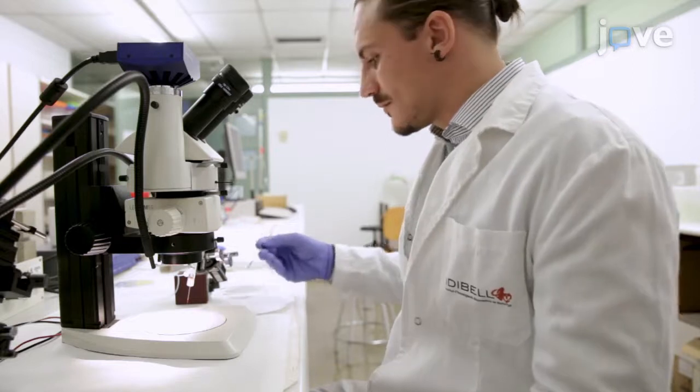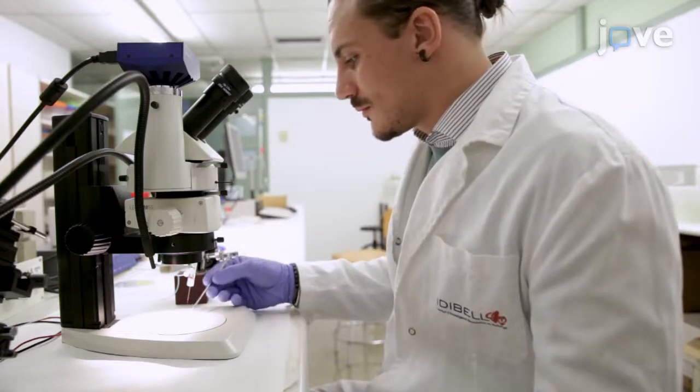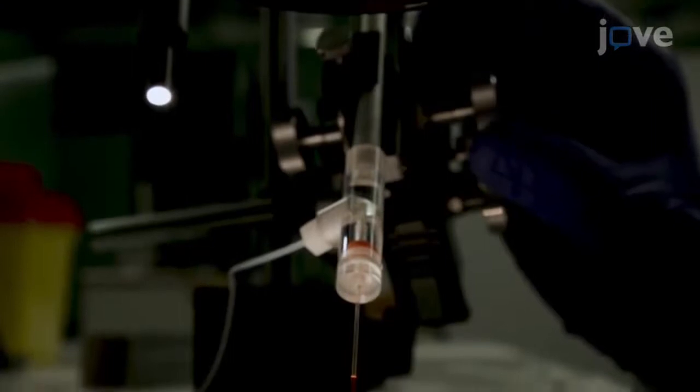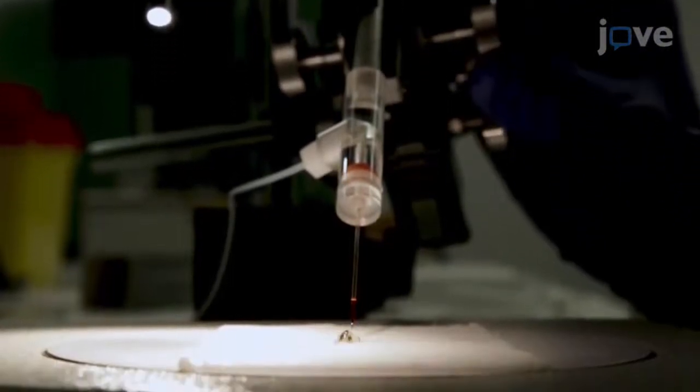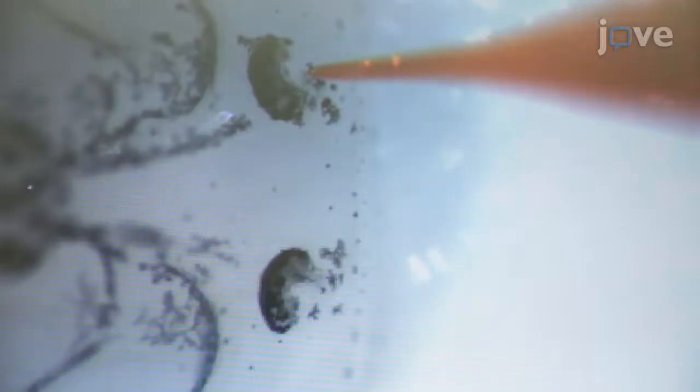Place an anesthetized tadpole under the dissecting microscope on filter paper. Then move the tip of the pipette into the principal cavity of the nasal capsule and deliver 0.15 to 0.3 microliters of solution.